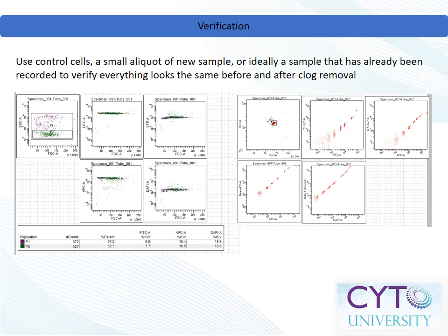As with any assay, reproducibility is key. This too is true for procedures as unglamorous as clog removal. To this end, it is important to verify that the instrument has not changed in any way as a result of your intervention. Ideally, you can rerun a sample that was successfully run before the clog occurred, but in the absence of such a sample, control cells such as glutaraldehyde-fixed chicken red blood cells, leftover compensation control samples, or even quality control beads can be used to verify the instrument's performance. In a pinch, you might elect to run an aliquot of a new sample to verify that the clog has indeed been removed and your instrument is performing as expected.